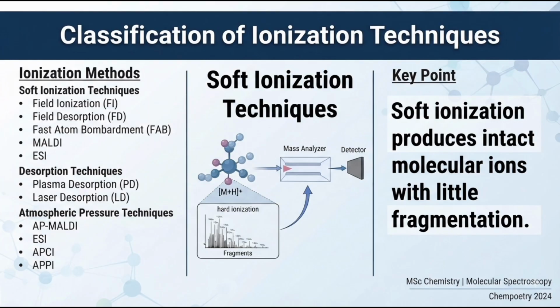So, remember this simple concept. Hard ionization is equal to more fragmentation. Soft ionization is equal to molecular ion preserved. This difference is extremely important for examination purposes.